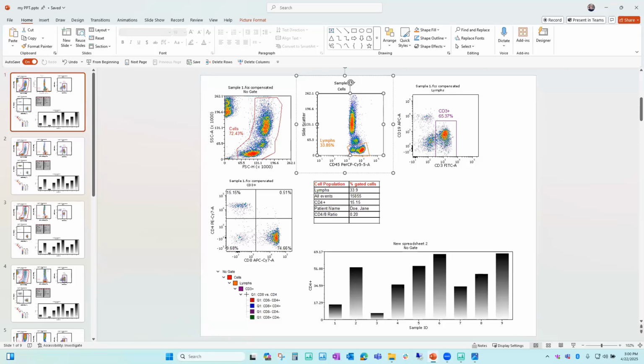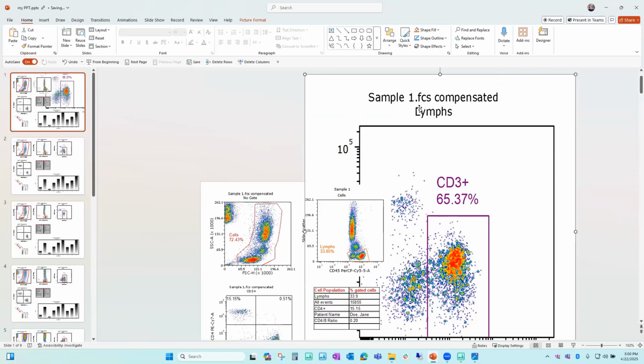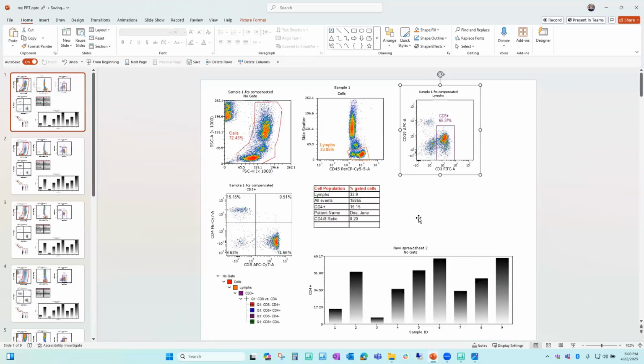But if you want to just do a one-time fix here, you can do that with the way these graphics work. And it's really kind of cool. The idea is that it just saves you some time. These are high resolution images, so we can export, or we can increase the size. You can see that they stay nice and crisp. Okay, so I'm going to close this.